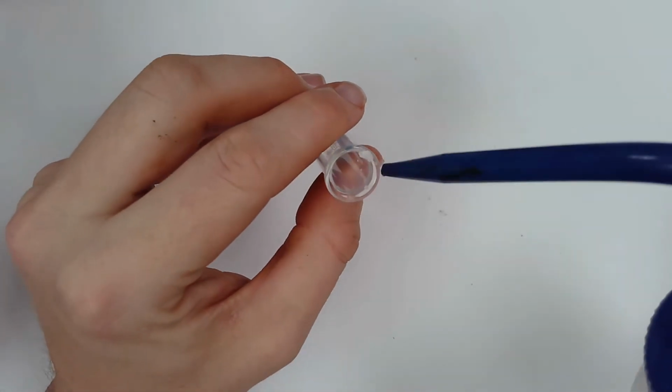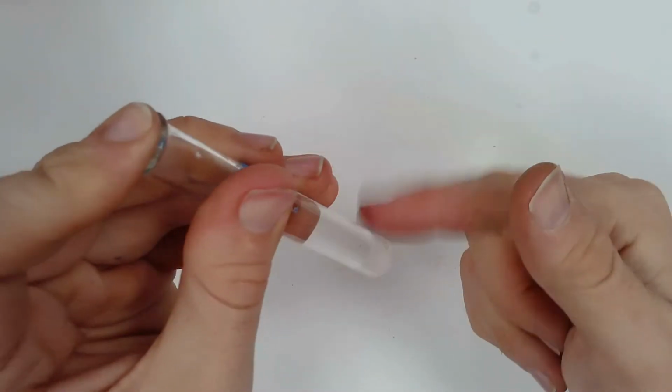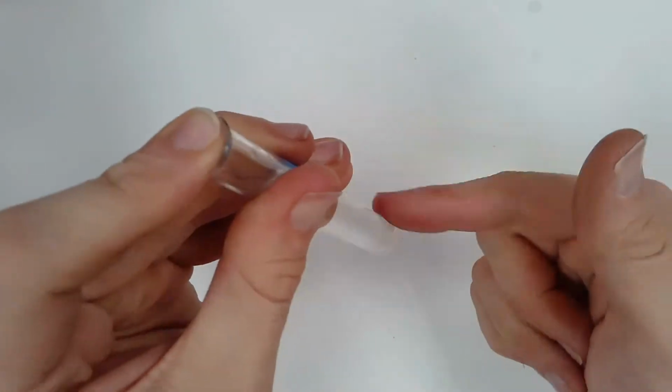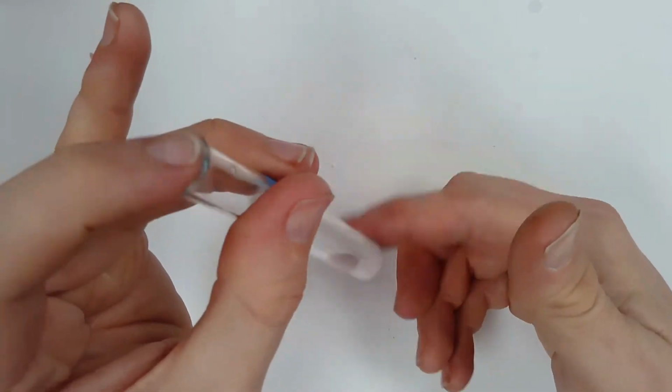All right, so I'm going to use this distilled water, and I've got my salt in there. And it's not dissolving right off the bat, of course. So I'm going to need to sit here and mix it. Now, this chemical is relatively dangerous. I don't necessarily want it on my fingers. And you can see this takes some time. Chemists are lazy people, and I don't want to do this for very long.